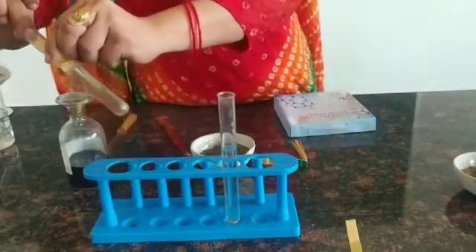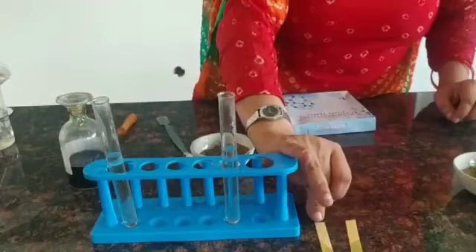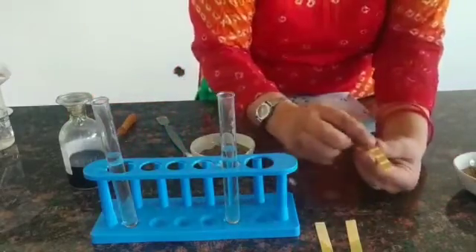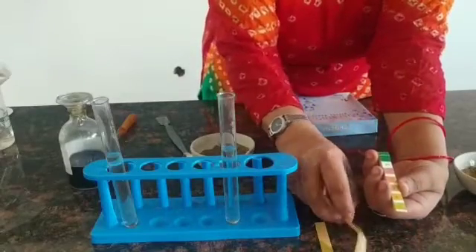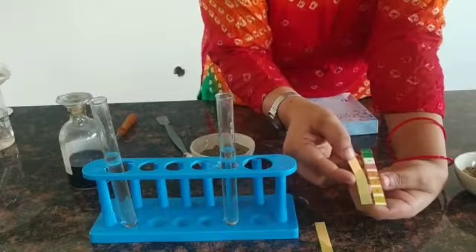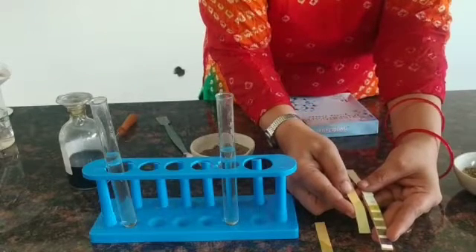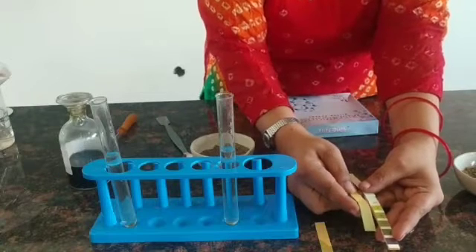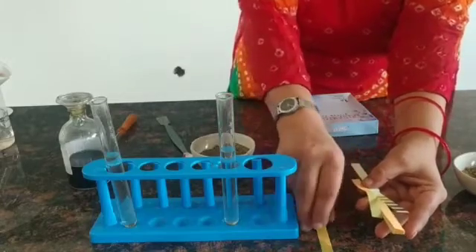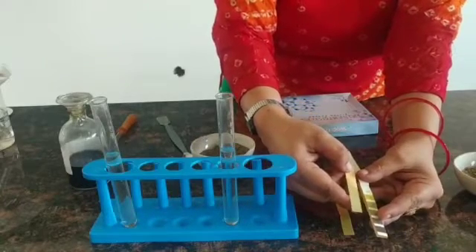Similarly, we will check the pH of the other test tube — dip the pH paper, let it dry for some time, and compare with the pH chart. The garden side soil pH and the roadside soil pH will both be compared with the pH chart. Another method of checking the pH is by using the universal indicator.